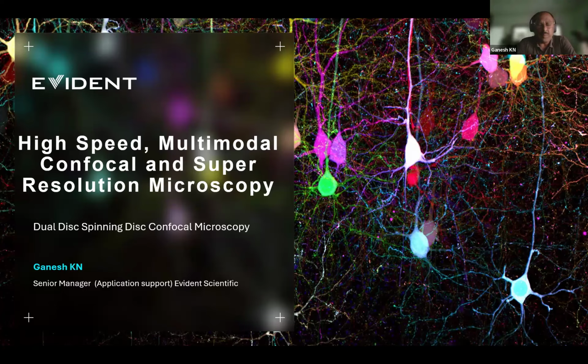Coming to the basic requirement of any confocal microscopy, as you know, confocal microscopy is considered to be the gold standard for fluorescence imaging. It gives you excellent signal to noise ratio, better resolution, and it helps us perform multi-channel, multi-dimensional image acquisitions. However, there was a limitation in confocal microscopes. The resolution was always limited to around 230 to 250 nanometers. That means if you want to see molecules that are smaller than 250 nanometers, confocal was not the solution.